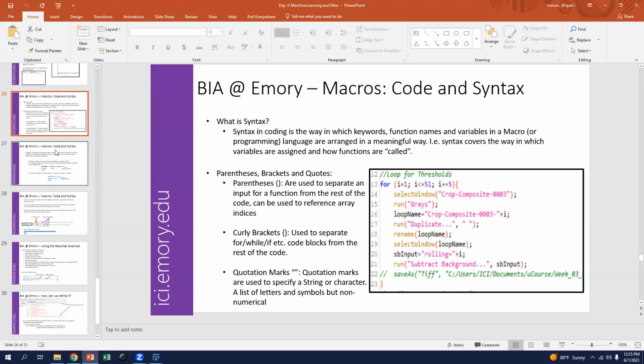So my recommendation for that is use descriptive names. They don't have to be very long, but ideally they tell you what the variable holds. That can kind of help you as you go back to it to remember what you wrote, and it can very much help a colleague later on that's working with the old macro to figure out what you meant to do.